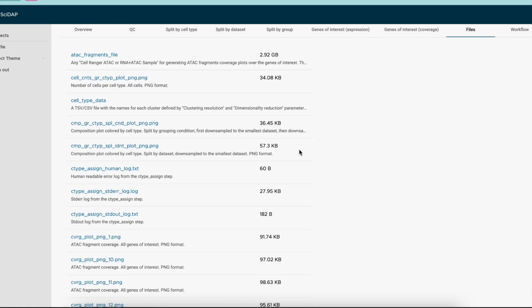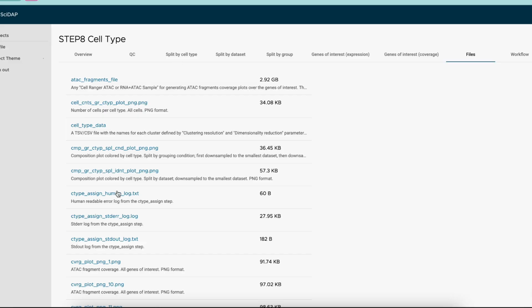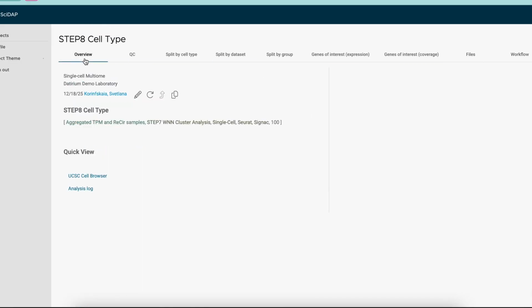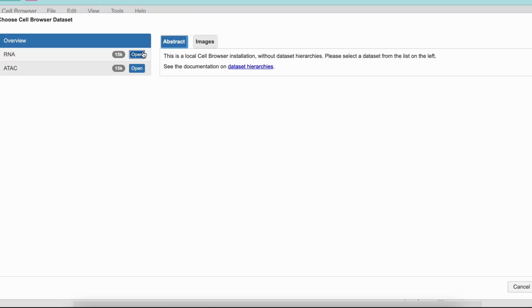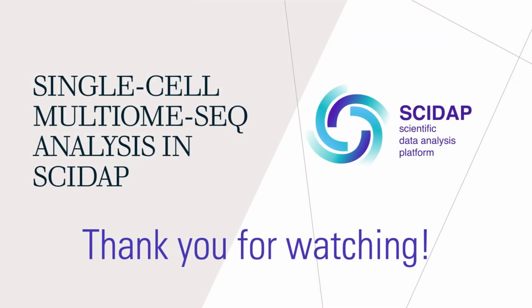So these are all ready-to-publish figures for your paper, and you could download every PNG plot if you'd like. So this was our final video, and you could see now here in the UMAP all the cell types together. I hope this tutorial series was helpful for you, and now you are an expert in using SciDAP pipelines. Good luck with your single-cell data analysis.